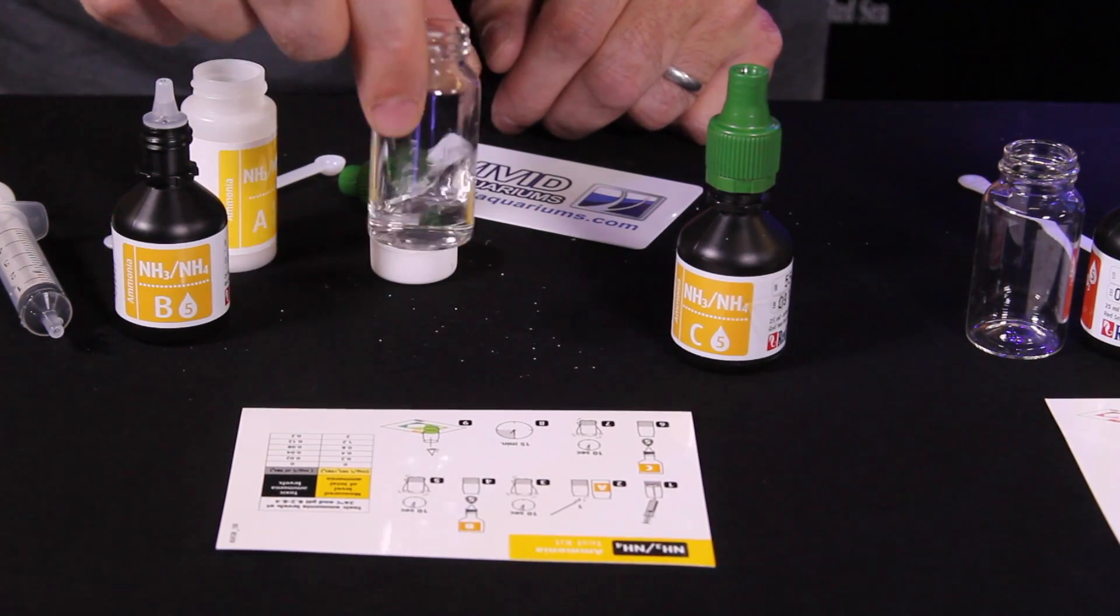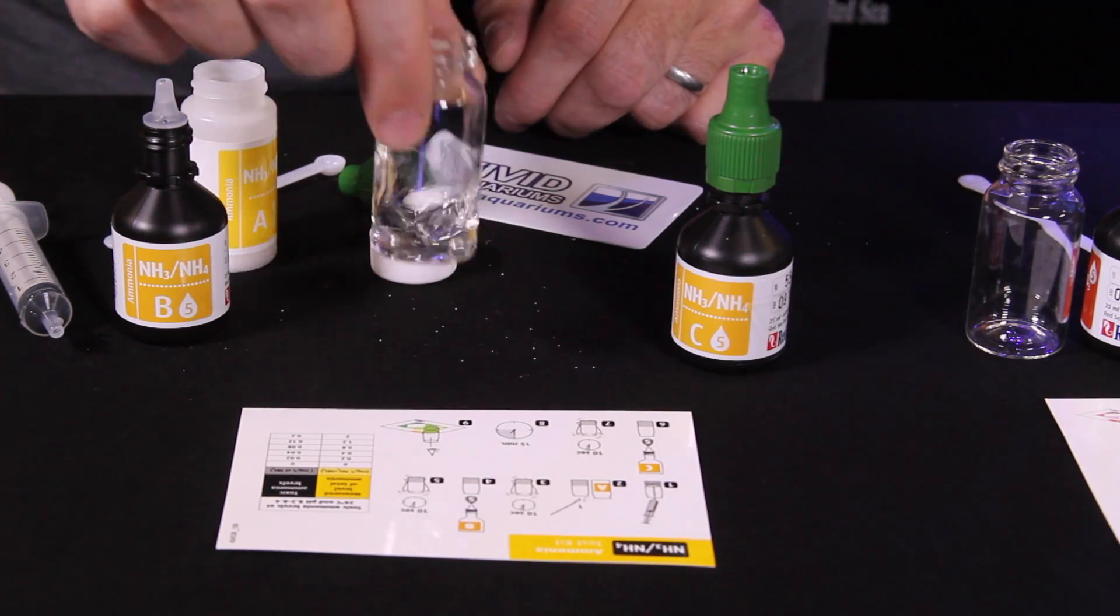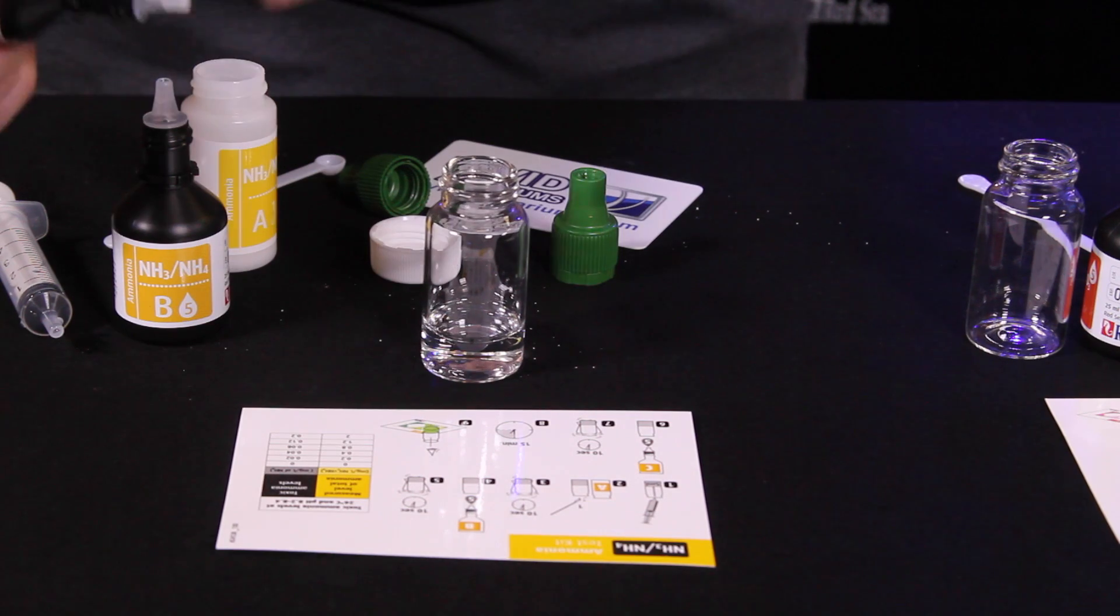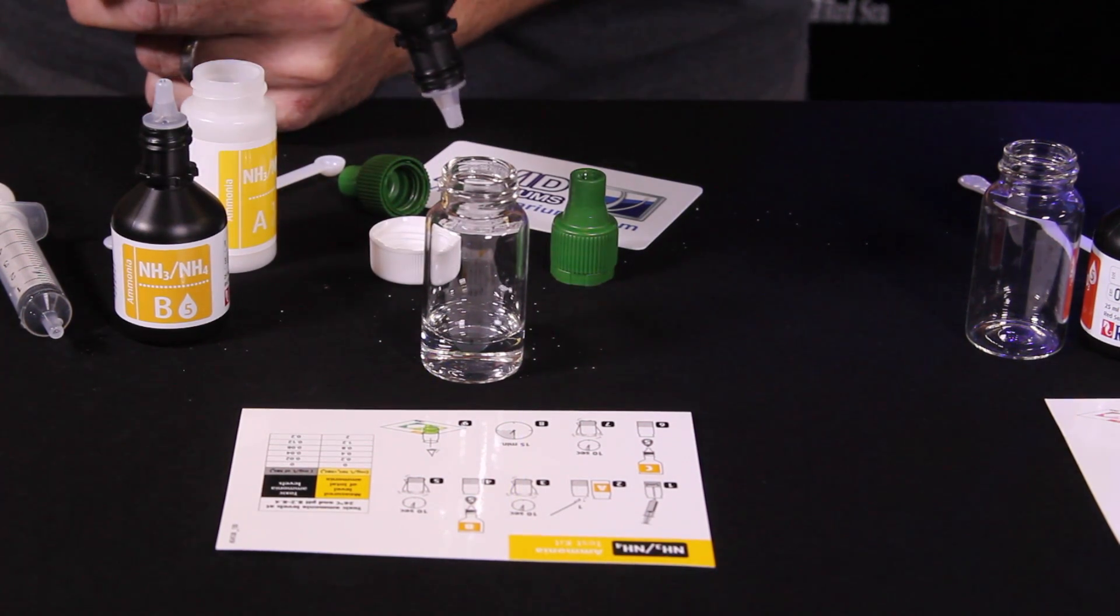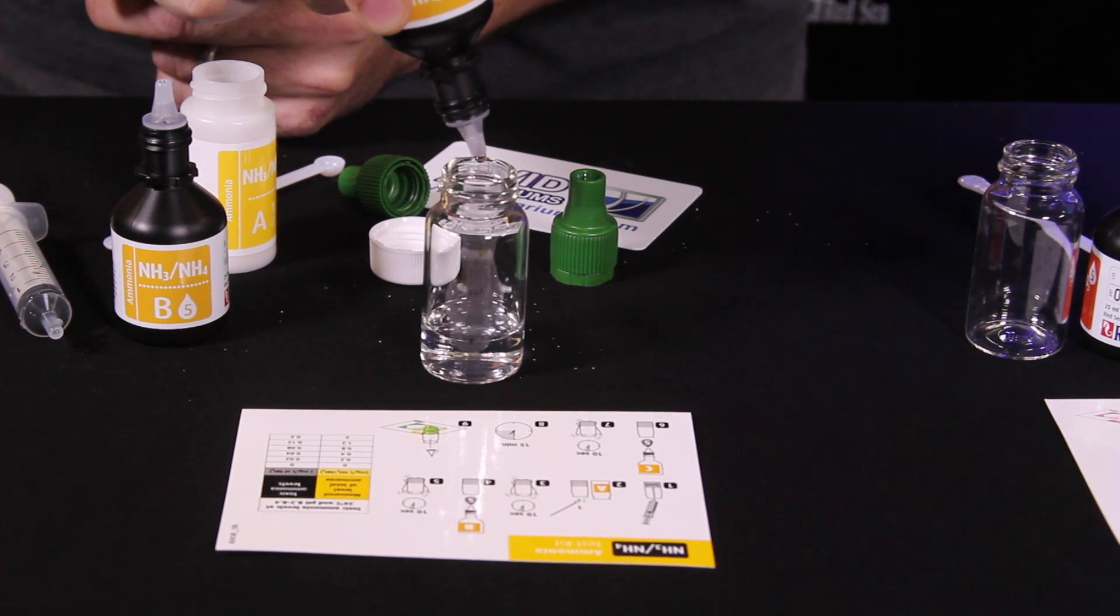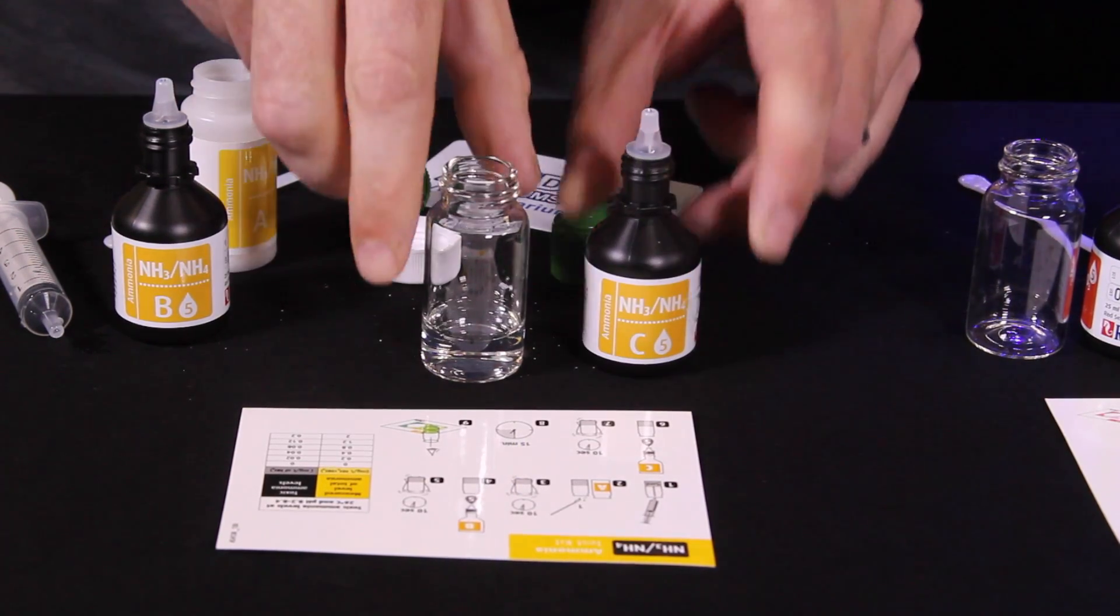Now we need to swirl again for 10 seconds. Make sure it's evenly mixed. Now the next step is reagent C. Again, five drops. There's five drops of reagent C.